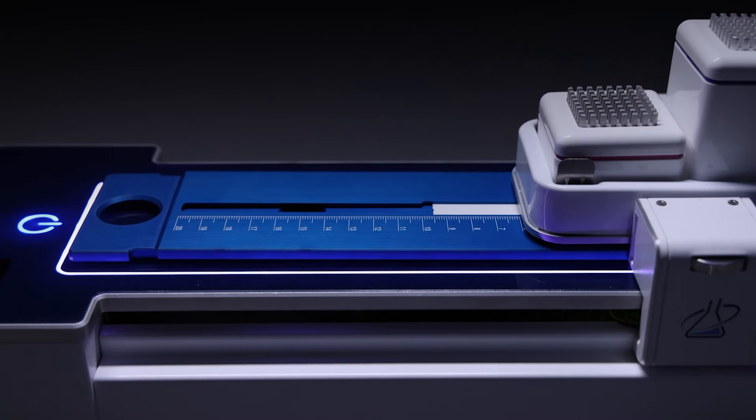The TLC strip holder is used for transporting and holding the TLC strip to prevent contamination and reduce finger dose to the operator.